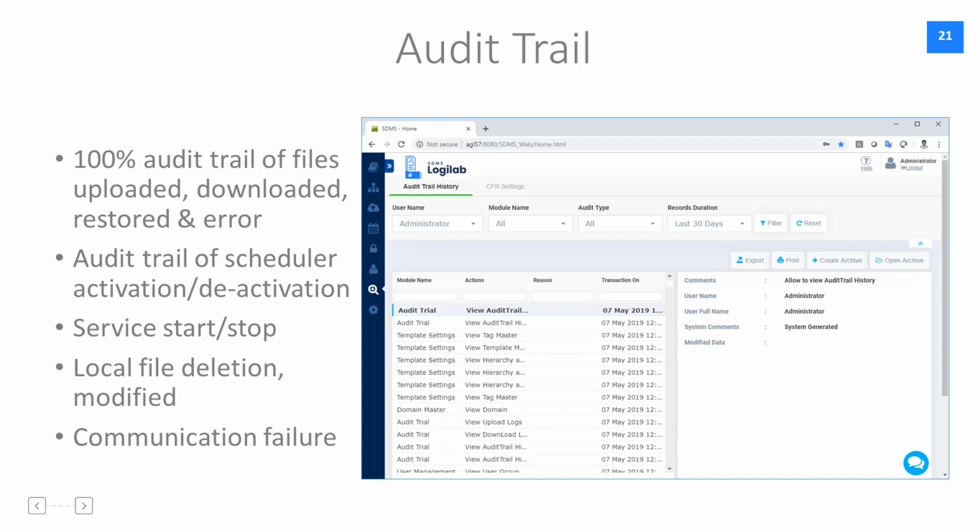Audit trail has features to filter data based on user-based or module-based type of audit trail, duration-based filters are available, and also there is a specific functionality for reviewing audit trails as well, where auditors can review specific audit trails and record them as reviewed by them, which are uniquely marked in the audit trail module itself. Audit trails can be exported such that auditors can take them away as part of their audits.